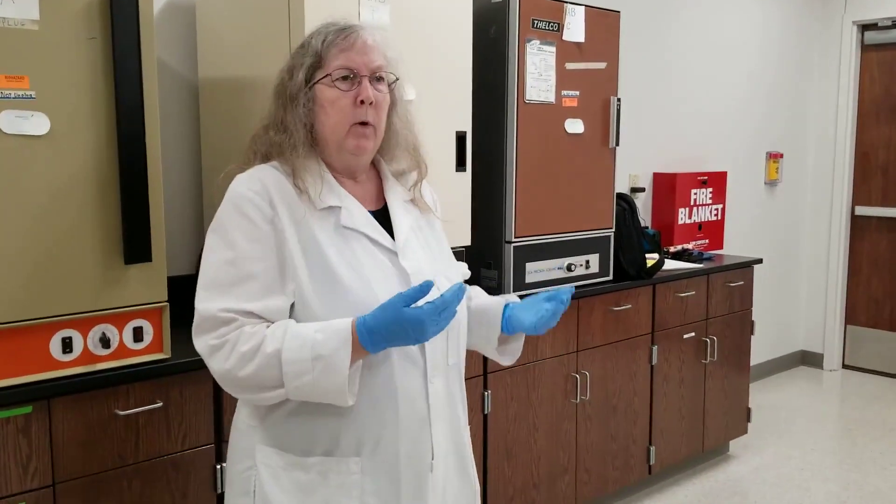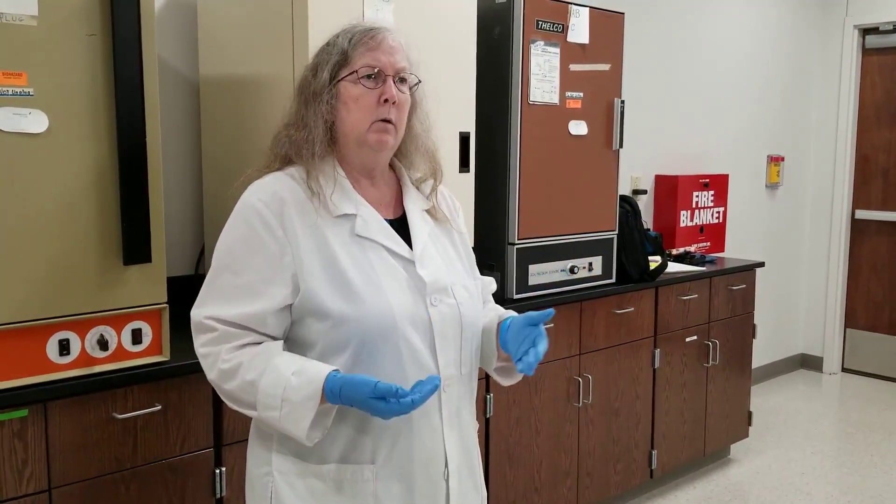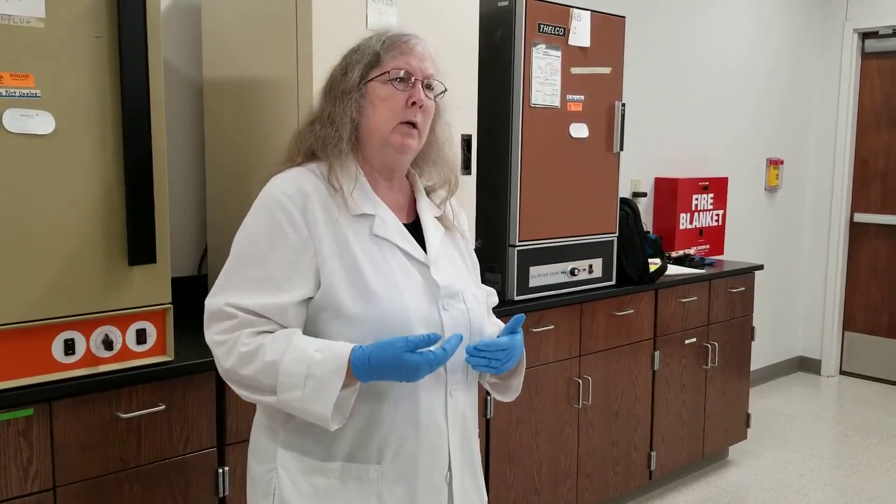In terms of people coming into the lab — extra people, your friends, family — they are not allowed in the lab. That's for safety. We just try to keep the numbers down. You don't want a lot of traffic coming in and out. If you need to meet with someone, meet them outside in the hallway. As I'm trying to supervise students and have you do experiments, we don't need a lot of extra traffic coming in and out.